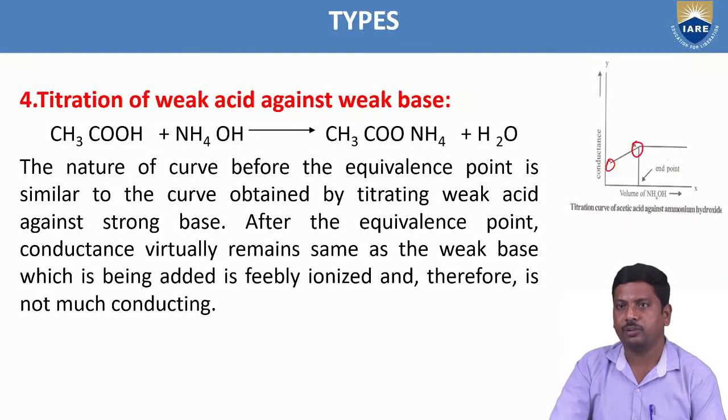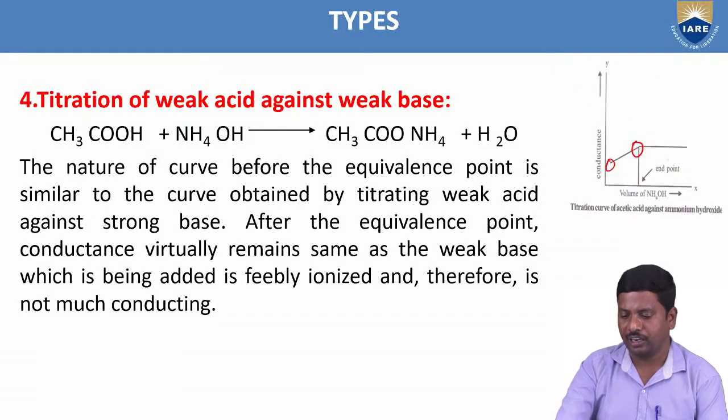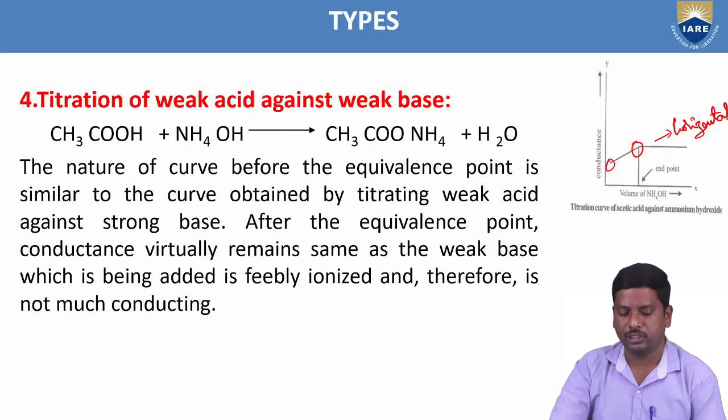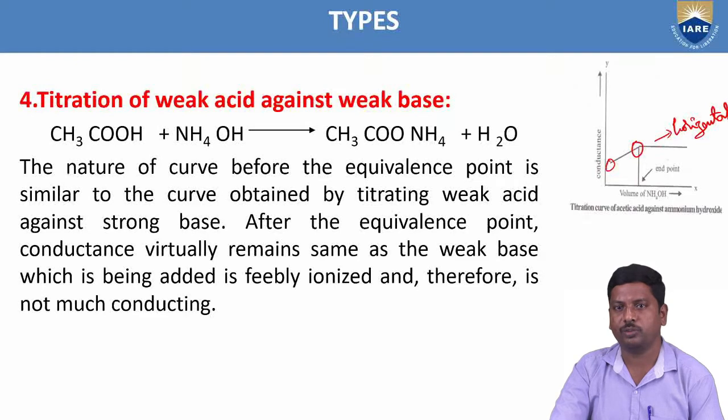But after the end point, even the salt is less conducting. That means ammonium acetate. That means there is no gradual change in the conductivity. Similarly, it also shows a curve parallel to the horizontal. That means the nature of the curve before the equivalence point is similar to the curve obtained by titrating a weak acid against a strong base. But after the equivalence point, the conductance virtually remains the same, as the weak base being added is feebly ionized and therefore is not much conducting.